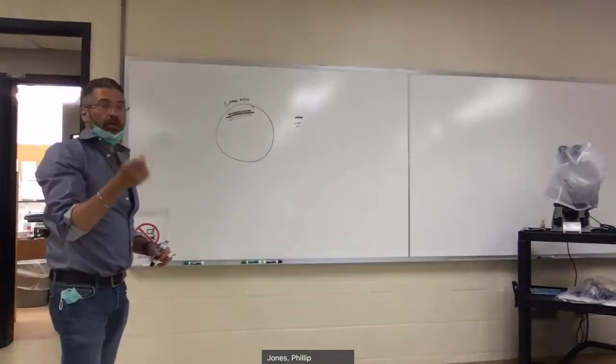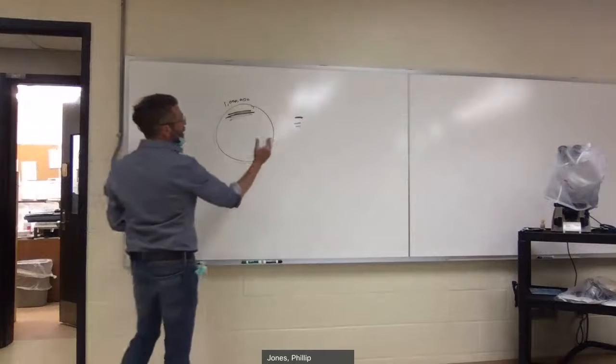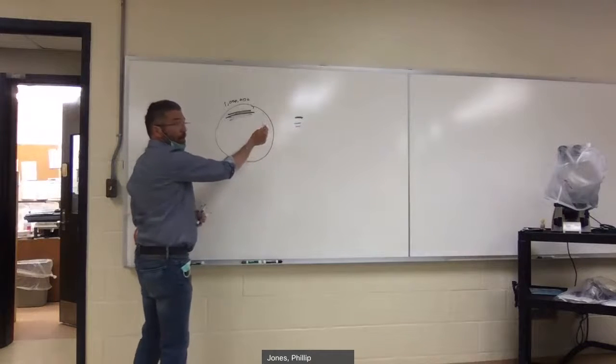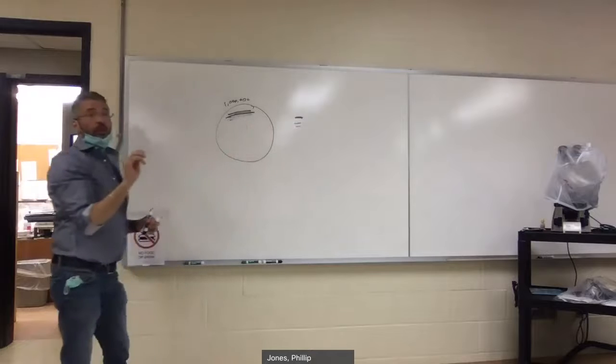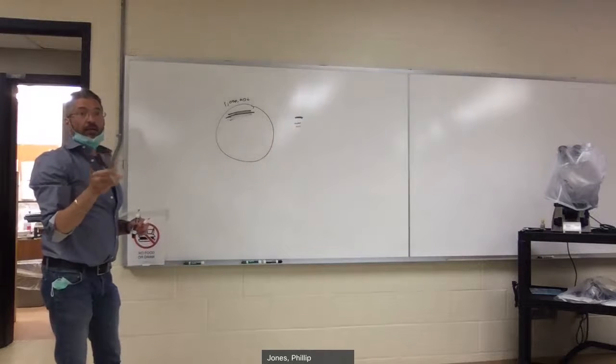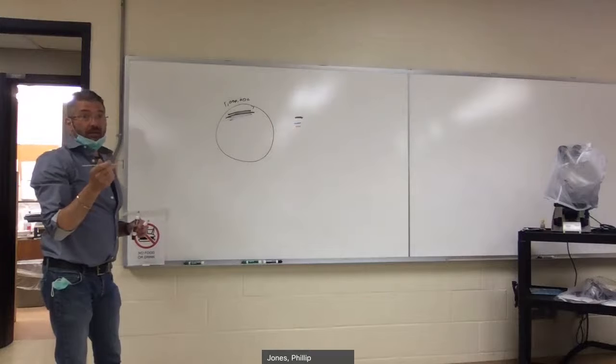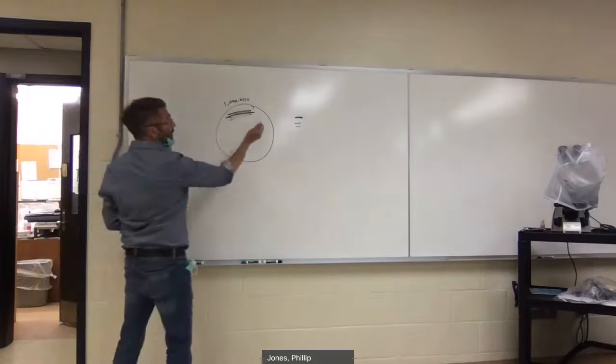Alright, so I'm going to sterilize that. I'm going to touch it to the agar here to cool it. Remember I said, if you stick the loop in there and it's super hot, you're going to hear the bacteria scream. They're going to sizzle and they'll be dead. And so I want to cool this off by touching it here.